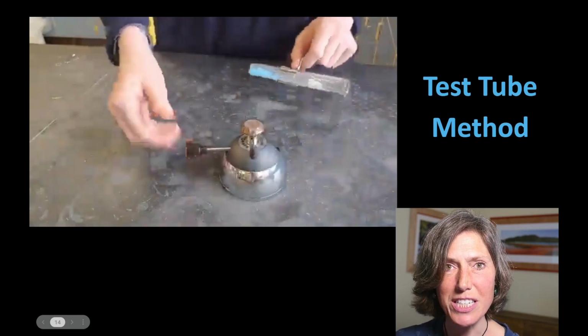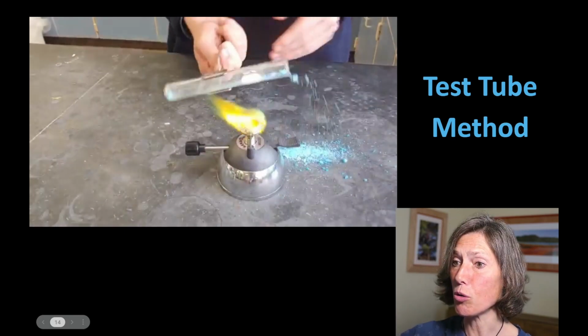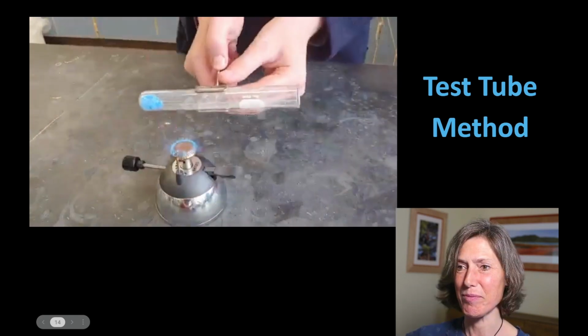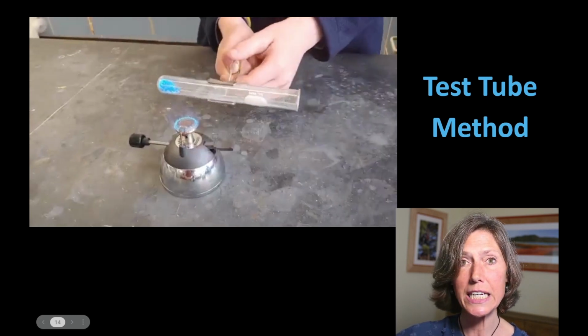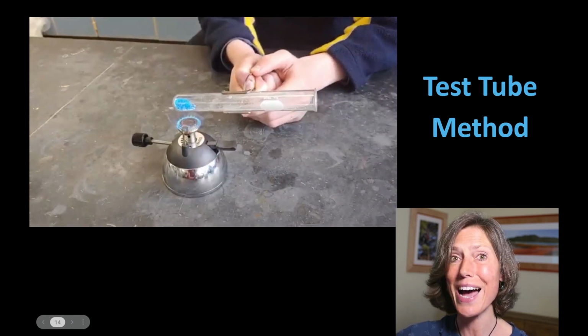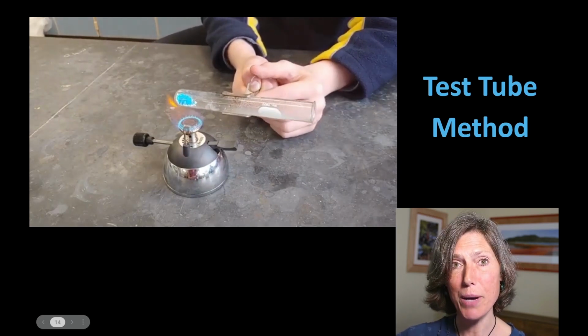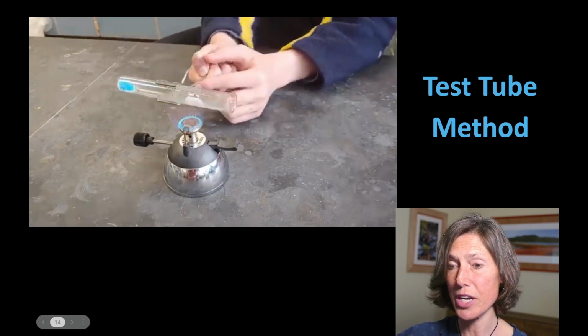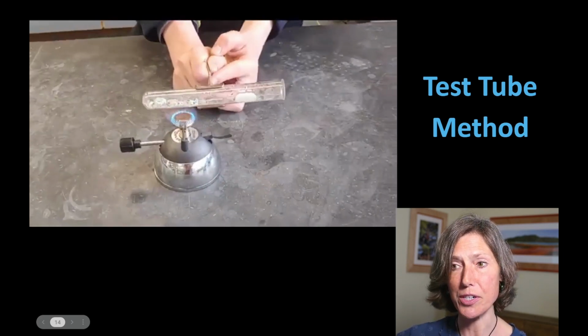The other method is a test tube method. Let's check it out. So don't do that. All right, so we're going to heat up the test tube with the finely ground up blue hydrate powder, copper sulfate, and over time, that blue powder is going to turn into a grayish powder. Obviously, you see some problems here, right?